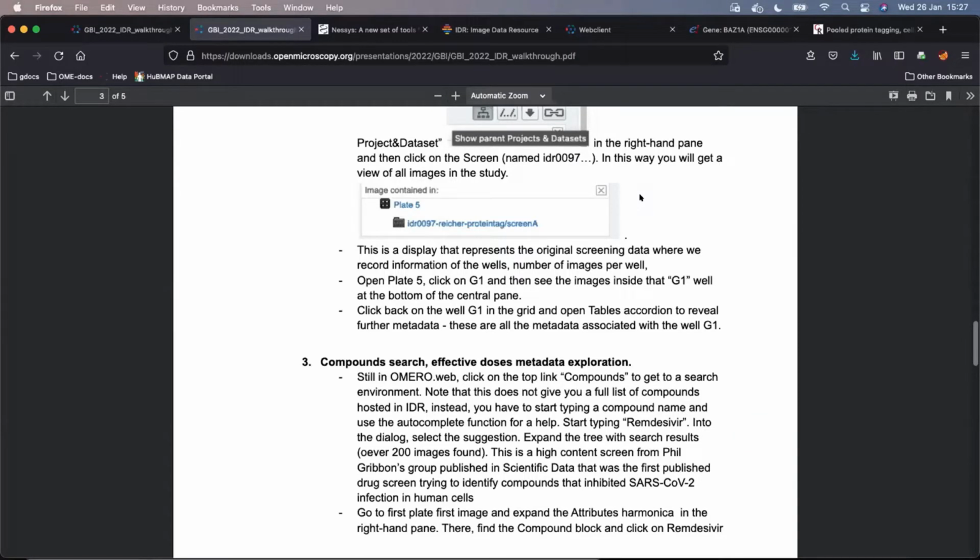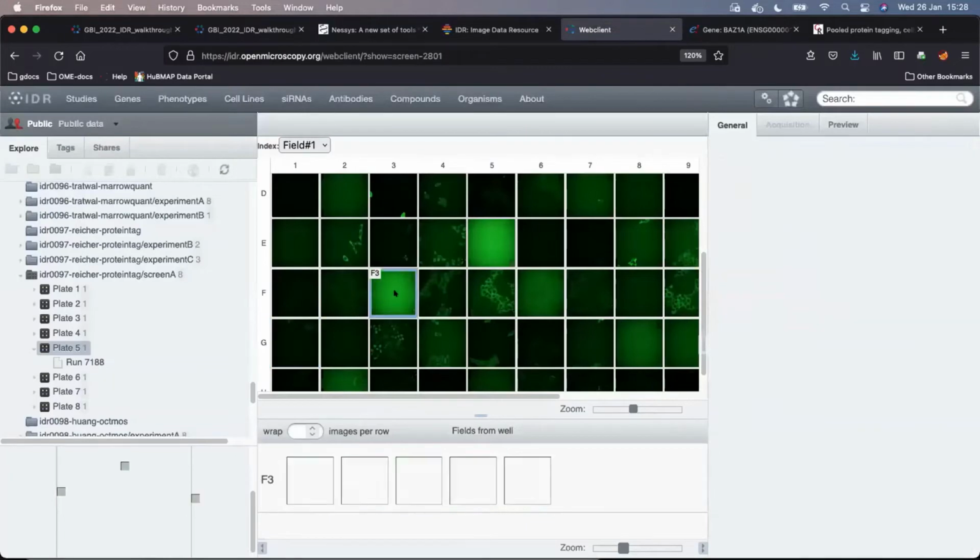Yeah, I mean the import as plate can have various options and interesting challenges to face depending on how it is submitted by the authors. And sometimes the curators must do some work.